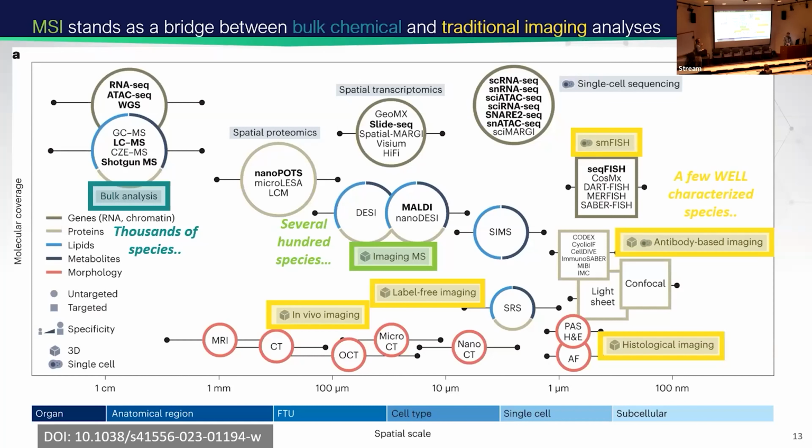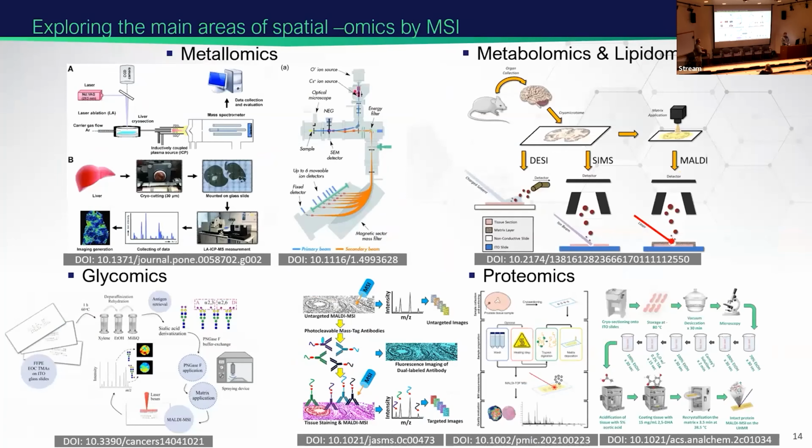And that's really what we're focusing on today, just giving you a very broad perspective of what's out there in terms of a lot of the actual techniques and what we can actually utilize mass spectrometry imaging for.